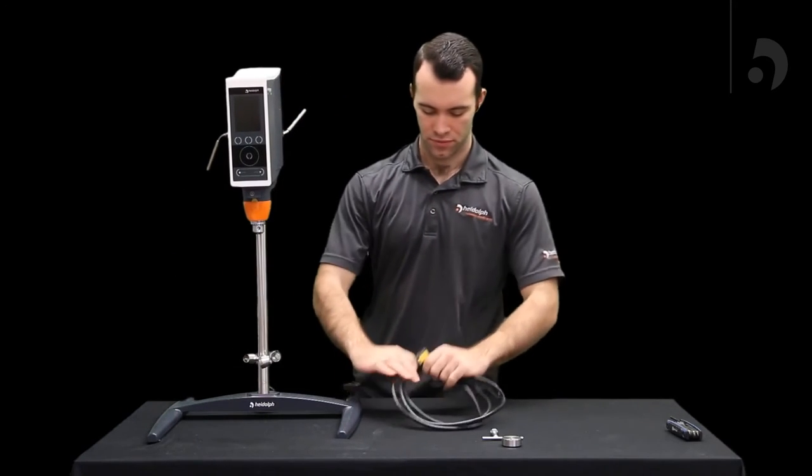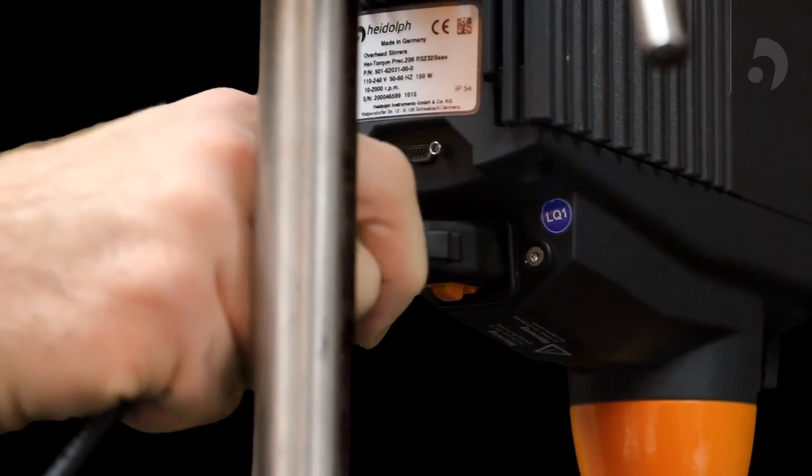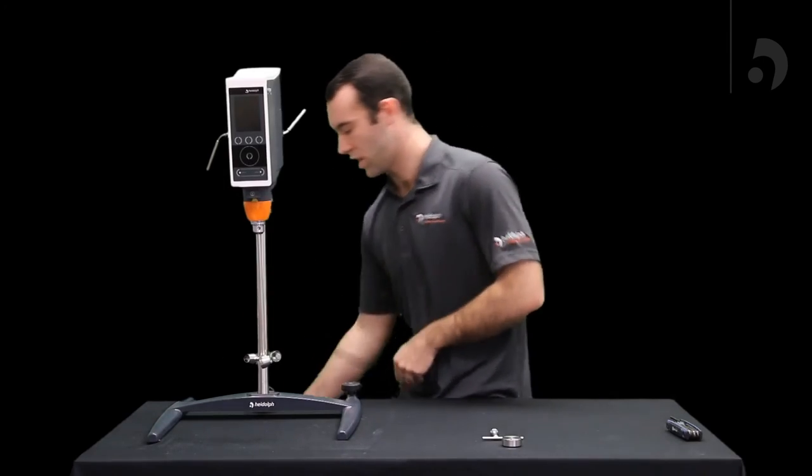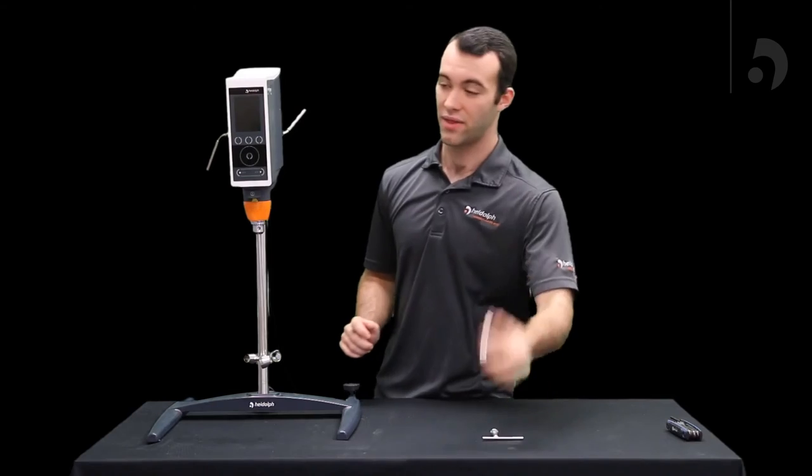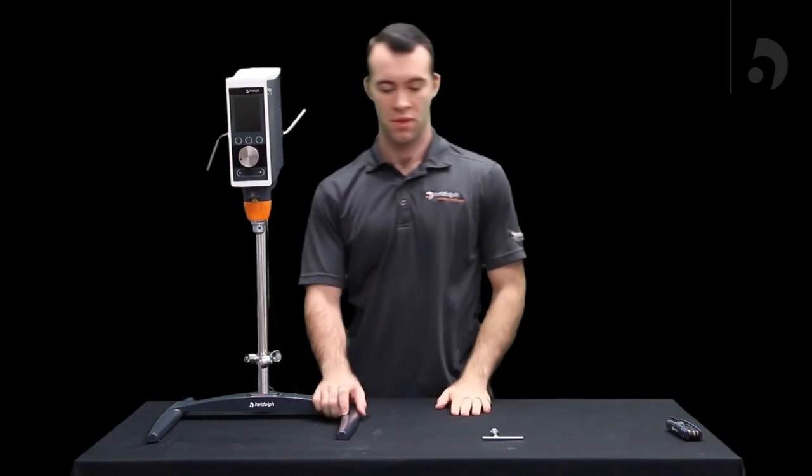Once you have that set up, you can take your power cord, insert it into the back, insert it into an outlet, and lastly add your magnetic smart knob. That was setting up your HITORQ, thank you very much.